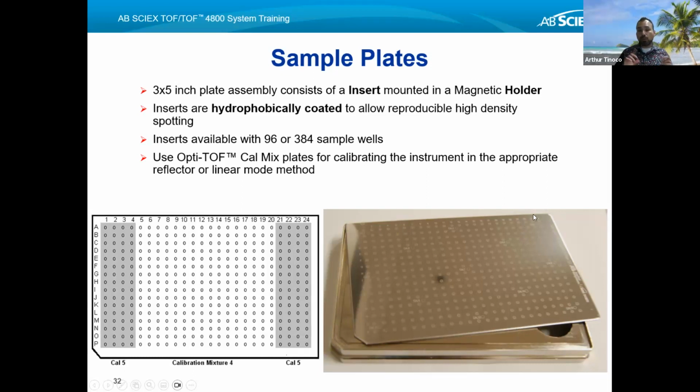I will note that when I do MALDI experiments, I tend to be pretty repetitive about the prep of my samples. What I mean by that is that I normally measure each sample more than once, and I also measure my MALDI matrix by itself, including the solvent that I use to make my samples, because I want to make sure that what I'm detecting in my sample is truly of the sample and not in my matrix or in my solvent.